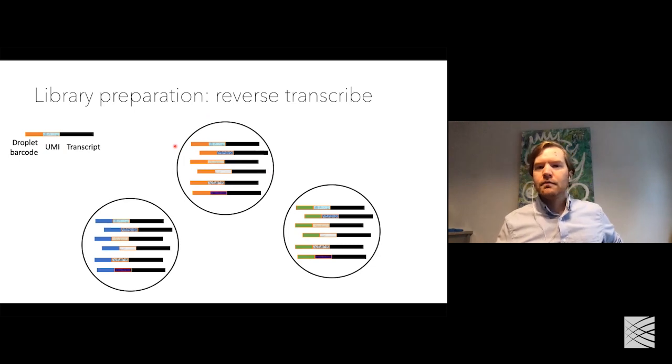Another question or a set of questions has come up, and this is, I think, immediately after the slide you have here. So what are the lengths of the reads that come out? And at what steps do you lose the most molecules per cell? Interesting. So the lengths of the reads, there are actually two reads in this process. Read 1 covers the barcode and the UMI. And read 2 covers part of the transcript. And that's typically like a 98 base read as far as the actual transcript is concerned. And sorry, what was the second part of the question?